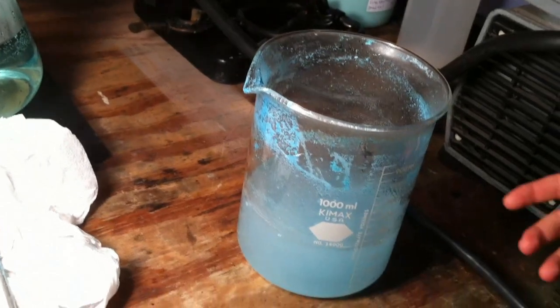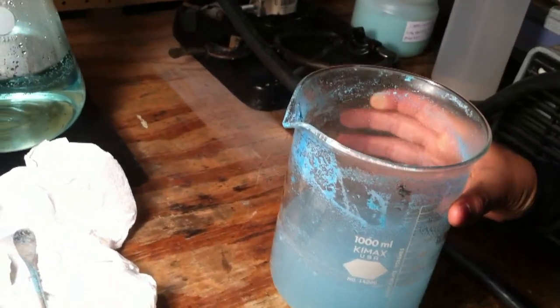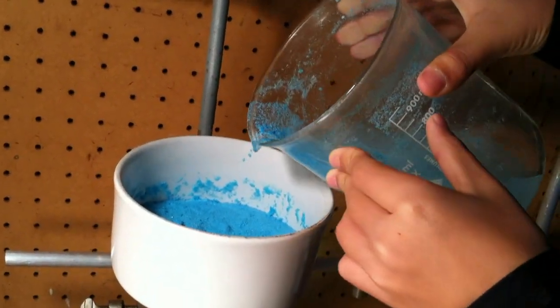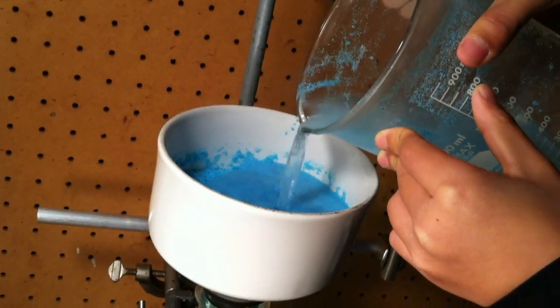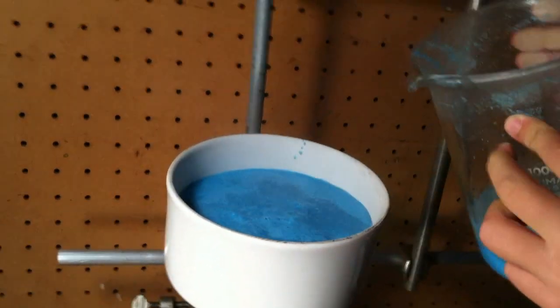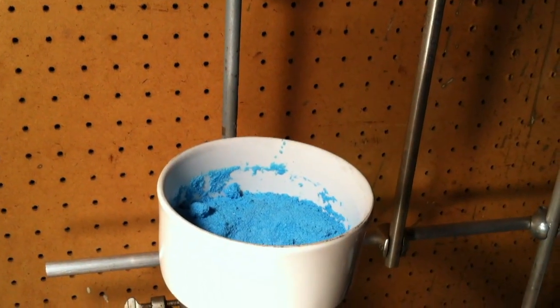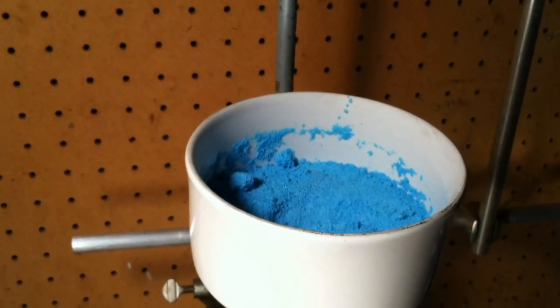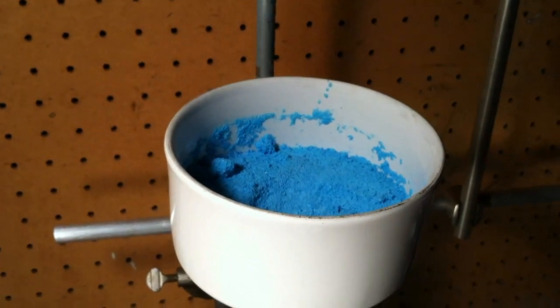Add some hot water and pour it into the Buchner funnel. Hot water will get rid of the benzoic acid. Leave the vacuum pump on until all the copper benzoate has dried.